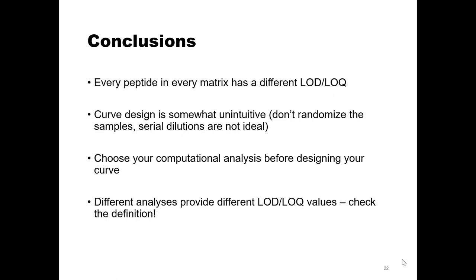That said, the most prudent thing to do is, whatever method you choose, once you calculate your limit of detection, you test a sample at that concentration, prudently with replicates, so you can get the coefficient of variation.